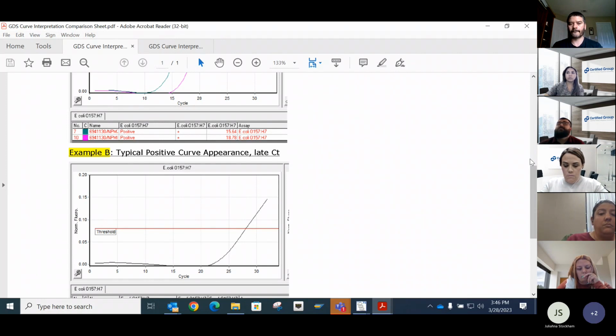Yeah. And I've seen it where sometimes it'll jump up and then the next cycle it kind of levels back out. What's going on in that? That reading had a little bit higher fluorescence level. And that's why you do not see the first 5 cycles, because there's not enough data and the lines are moving all over the place. But as the instrument gains more data into the algorithm for the software, the lines will normalize. If you look over here, it says normalized fluorescence, right?